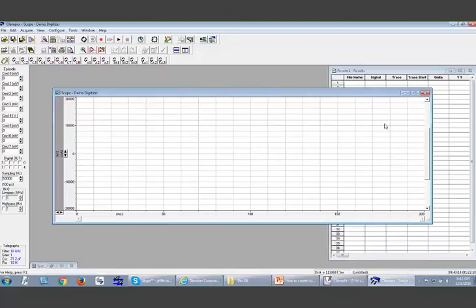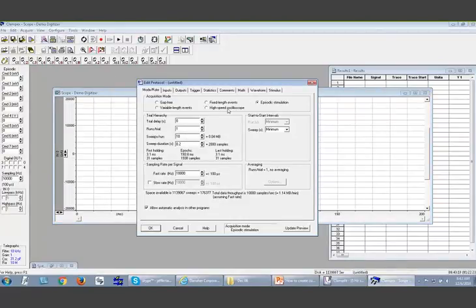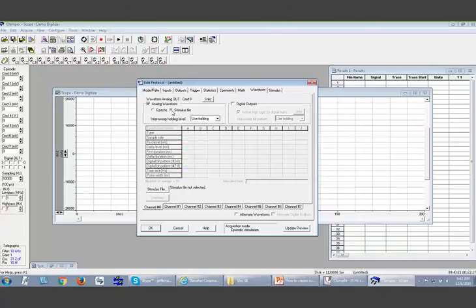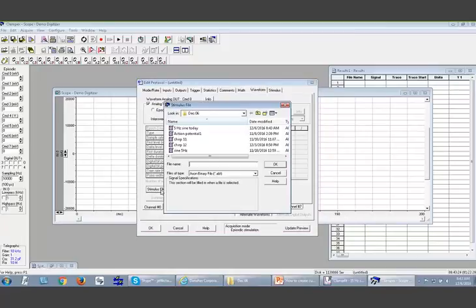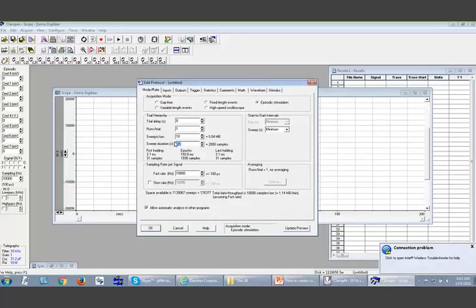Then you go to Clampex, and you have a new protocol, for example. Now you go to the waveform, go to stimulus file, then you choose the one we made today, the 5 kilohertz, 5 hertz sine wave, and hit OK. Now make sure that you have the same sweep duration. Remember that, 20 seconds, all right?